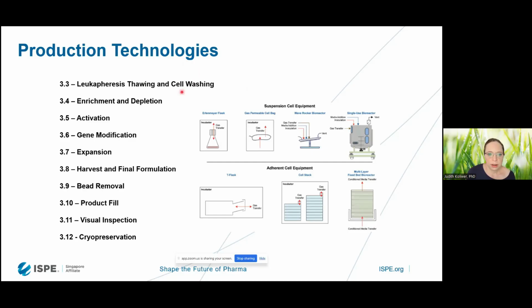And we also included in the same section cell washing. Again, you probably all are familiar with the process. So we know that cell washing happens in a lot of places during our process, but we just included it in the first step. And then, of course, every time that it would reappear over the process, the same would apply.